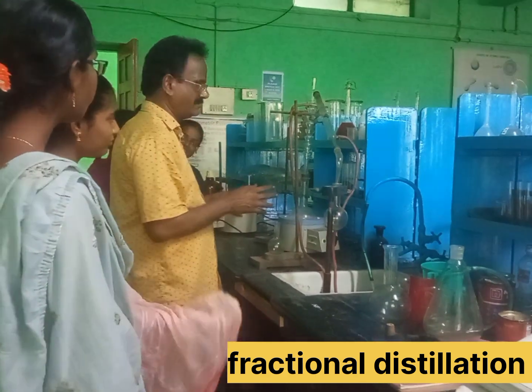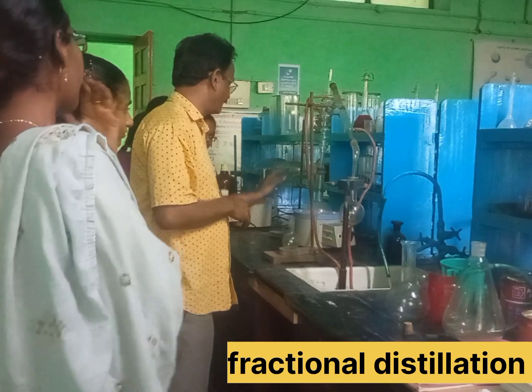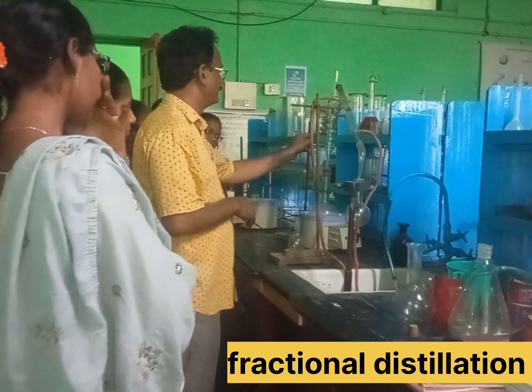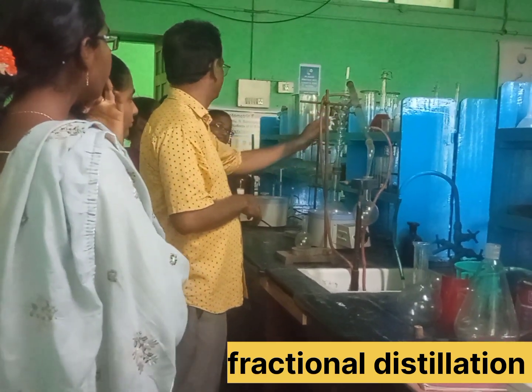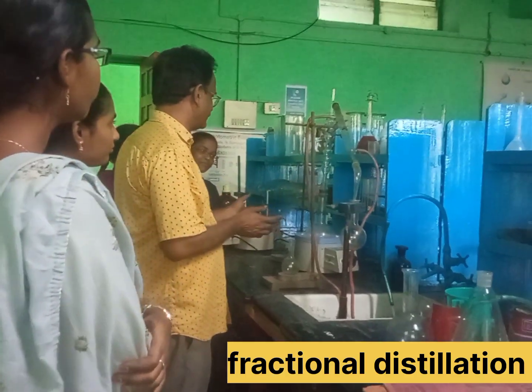The fractional distillation set up. The round-bottom flask, the fractionating column. The fractionating column and the flask will be set up.